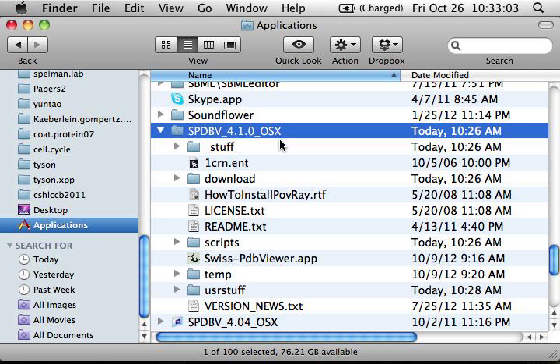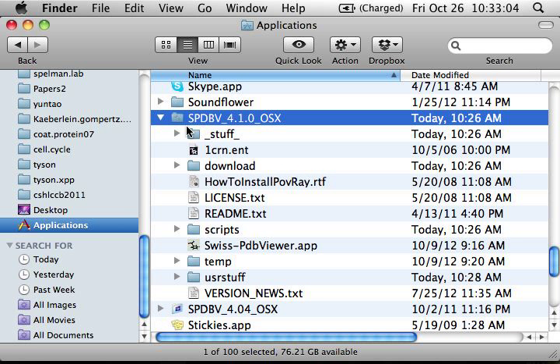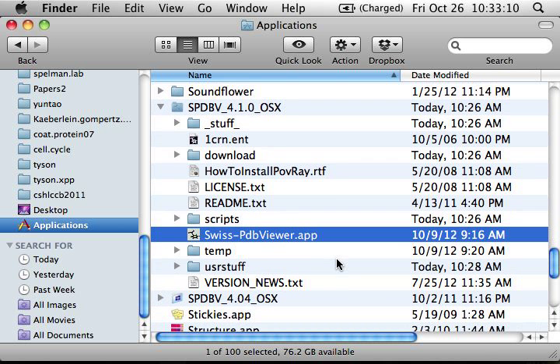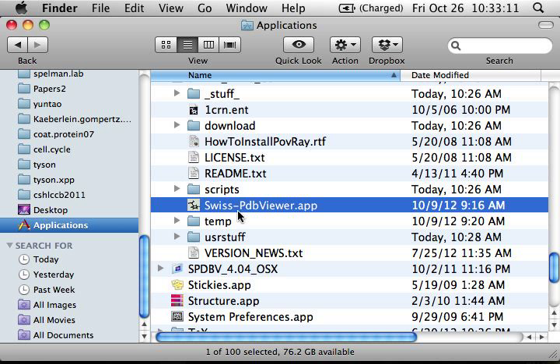So after dragging it into your application folder, and you double click, you should see a file called SwissPDBViewer.app. That's the application software on Apple.